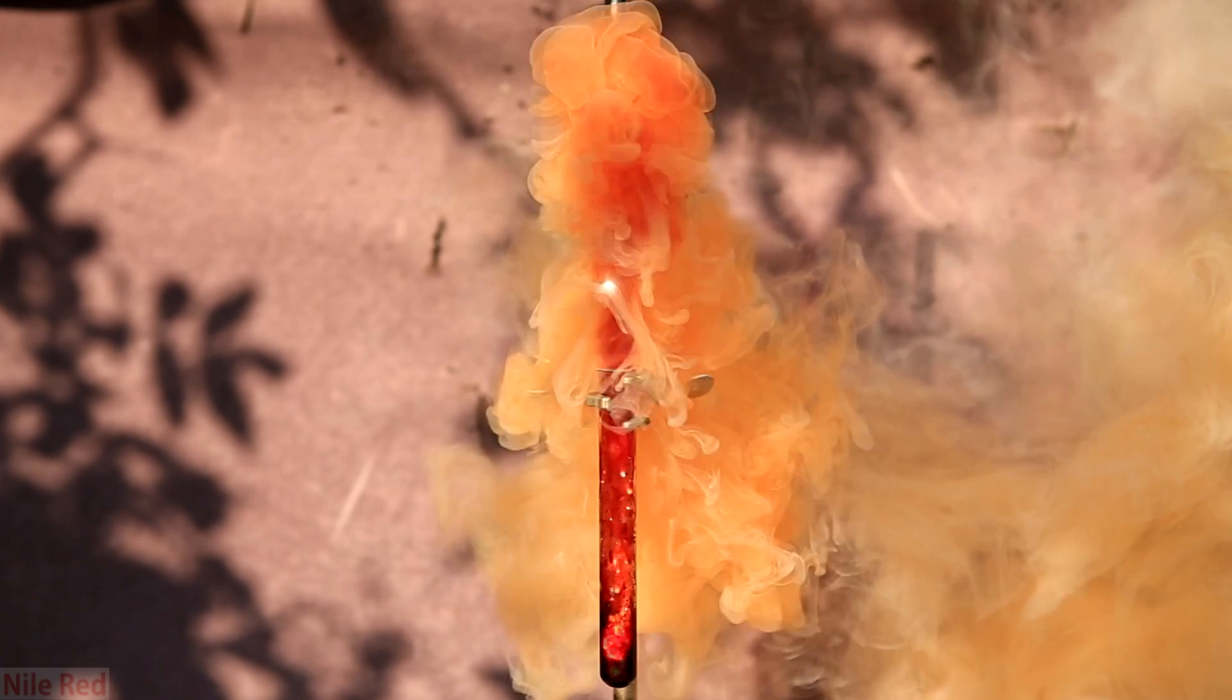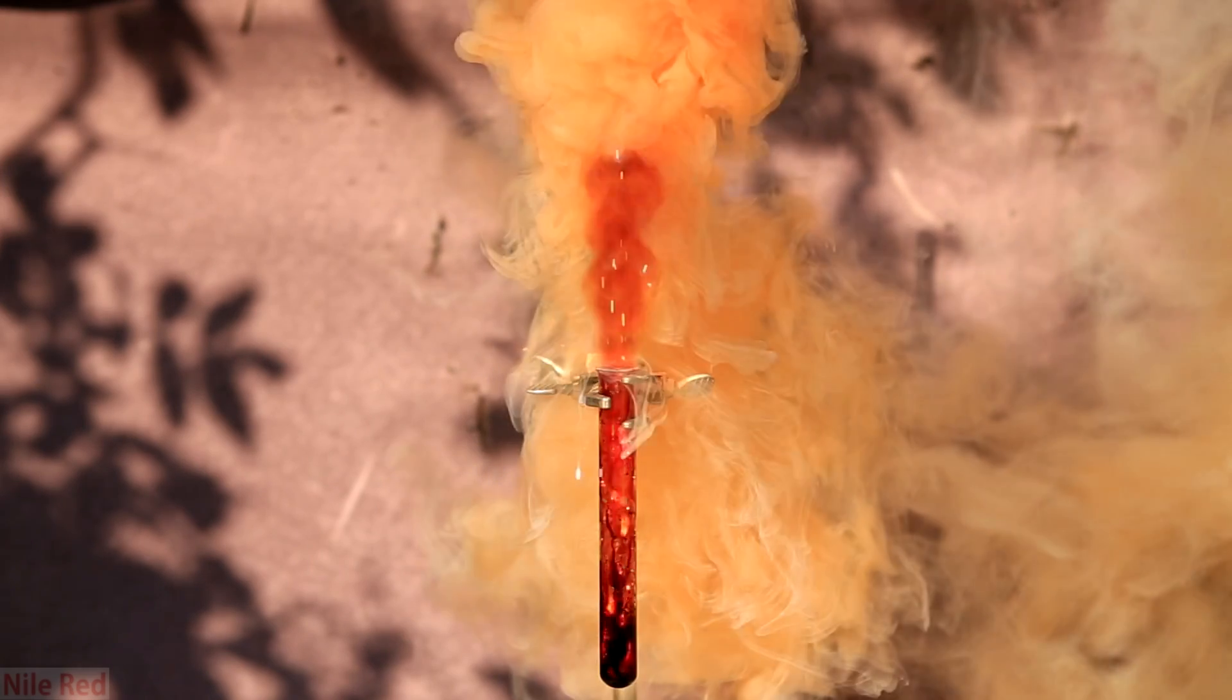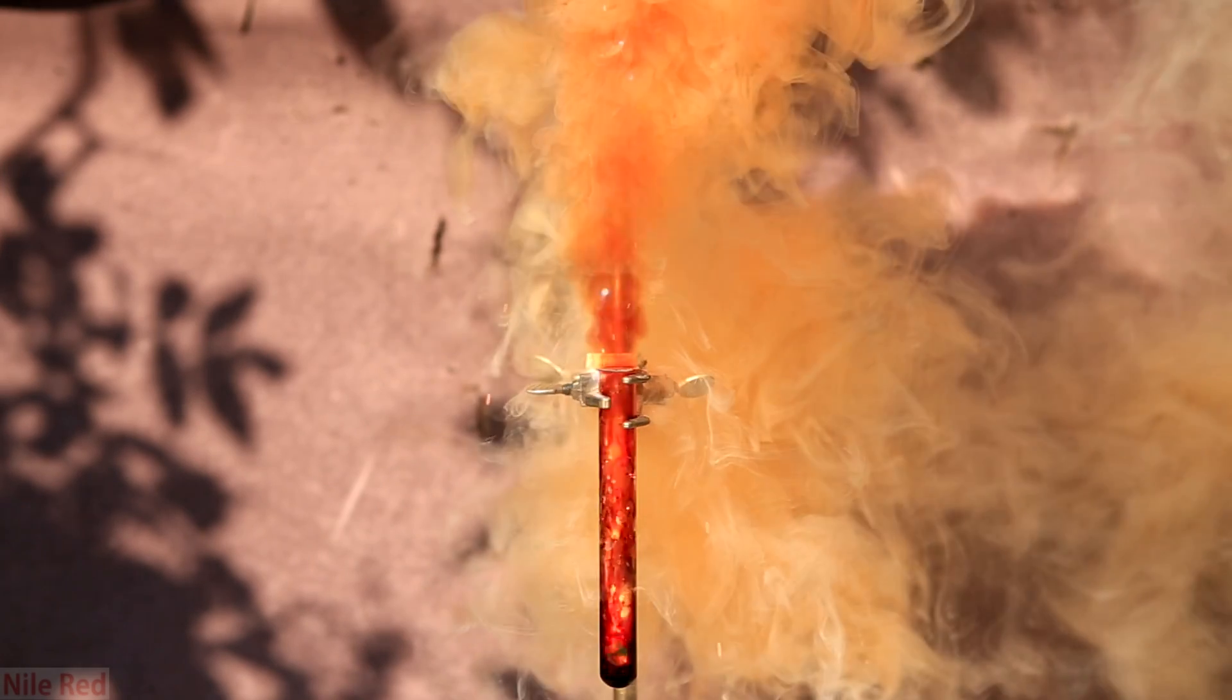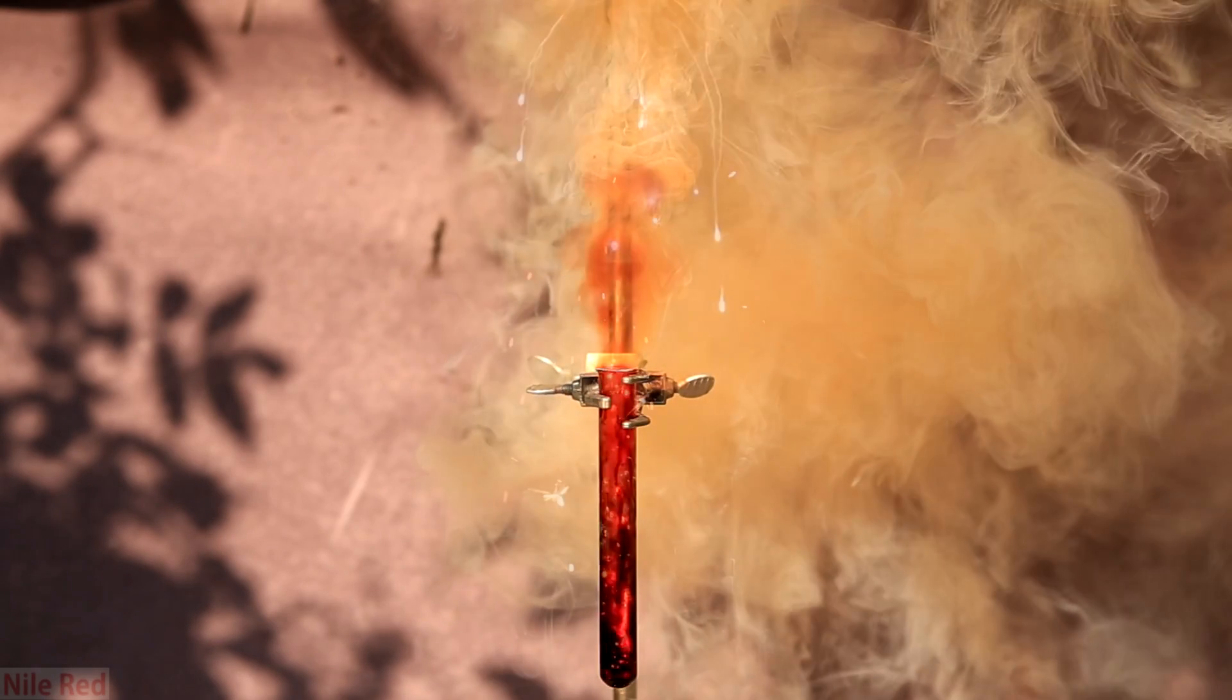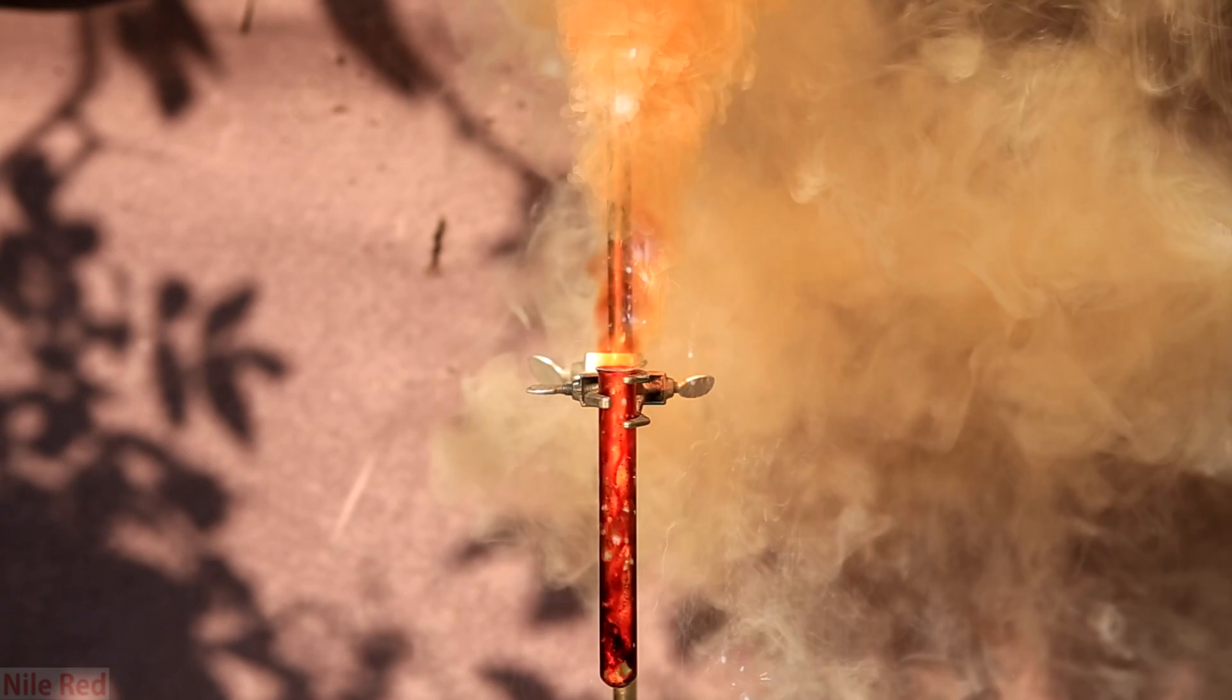When slowed down to about one-fourth the speed, you can actually see a molten red-hot ball of aluminum bouncing up and down the test tube. The white pieces that you see flying out of the test tube is actually liquid aluminum.